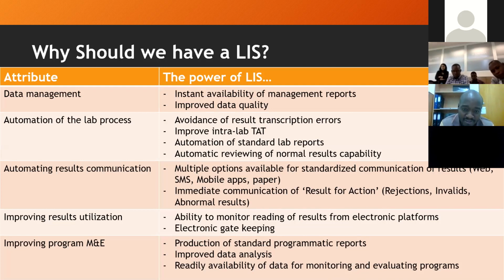When the results are ready and available, you can generate a standard report with the lab logo, contact information, and the standard way of reporting the results, including reference ranges and other comments that may be required. It also provides for automatic reviewing of normal results.